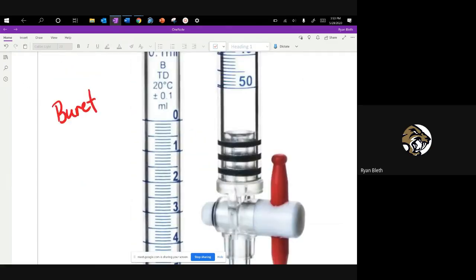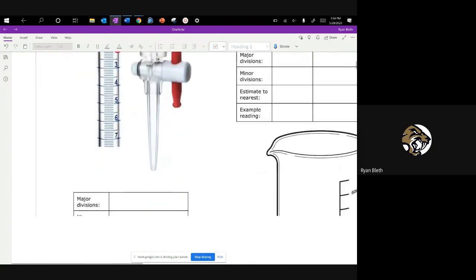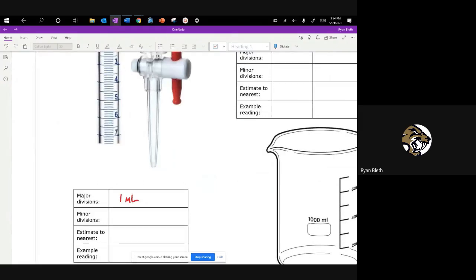If you look at this really closely, this has lines to the nearest tenth of a milliliter. The major divisions are for every one milliliter — one, two, three, up to 50. The fine lines are down to the nearest tenth of a milliliter. So our major divisions are to the nearest one milliliter and our minor divisions are to the nearest tenth of a milliliter. We can estimate one place further than that, and if we take that and divide it by 10, we can actually estimate our readings down to the nearest hundredth of a milliliter. That makes this the most precise instrument we'll use this way in a chemistry course.